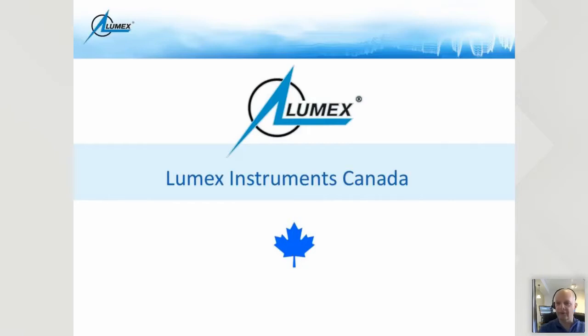I'm so humbled to see there's a lot of people, even on the 15th of December, joining in, so that's super great. A lot of people eager to learn a little bit more about certain technologies. Today, our webinar is going to be part 2 of how to set up a simple but yet powerful capillary zone electrophoresis method. And I'm just going to jump into my slides right here.